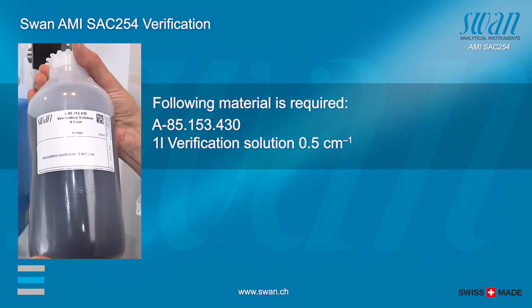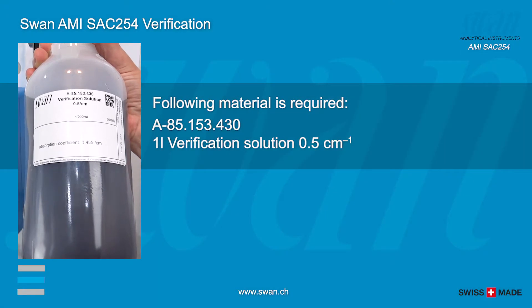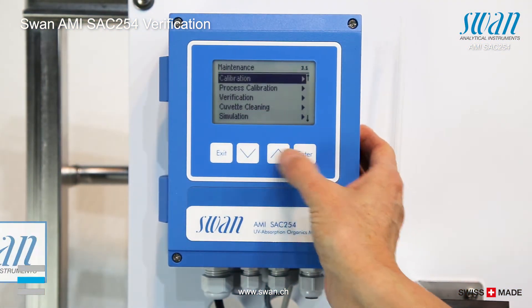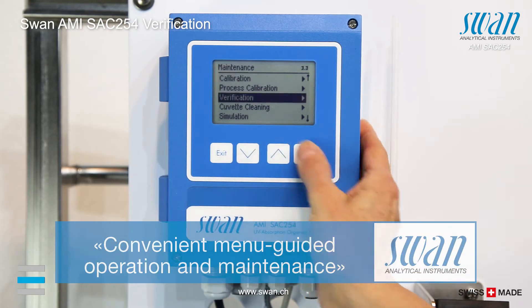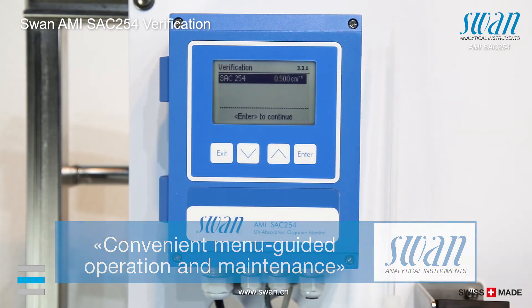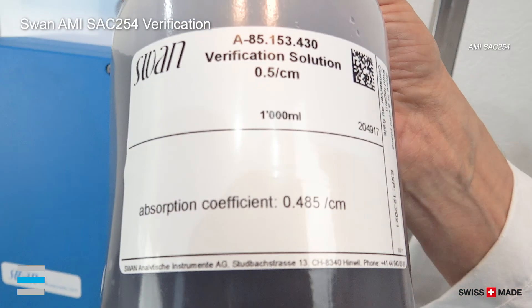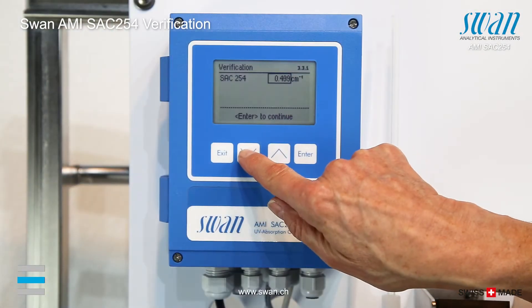One liter of standard solution provided by SWAN is used to perform a verification. The procedure of the verification is menu guided. Insert the precise value that is written on the standard solution bottle.